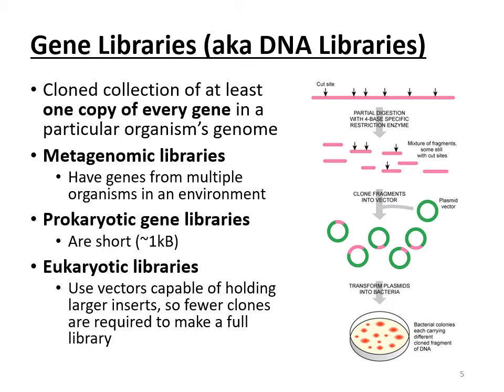They also have eukaryotic libraries. These will have a lot of times yeast genes, or you can do this with whichever organism you want. But basically the premise is the same: the final plate will have the whole library represented.